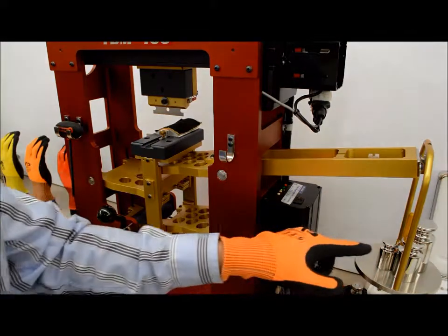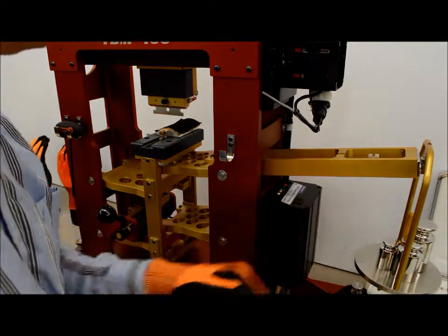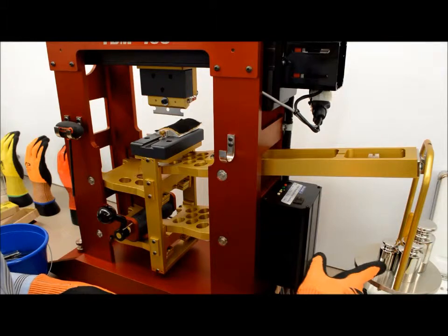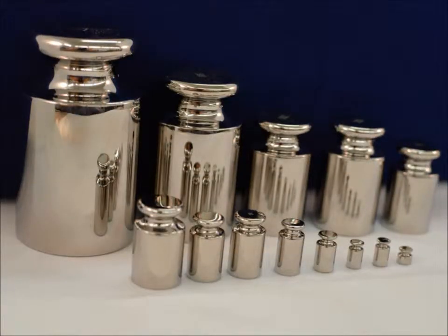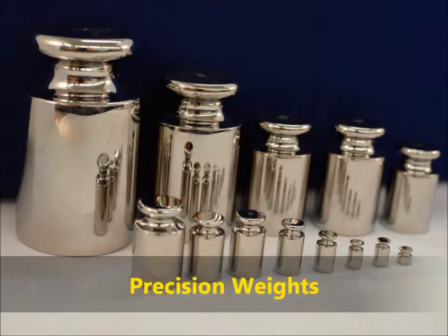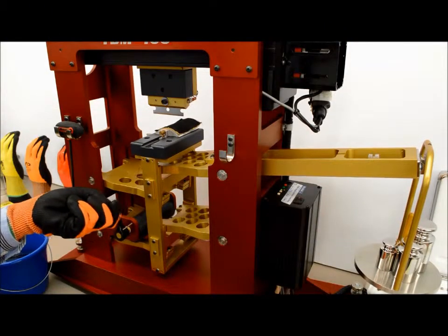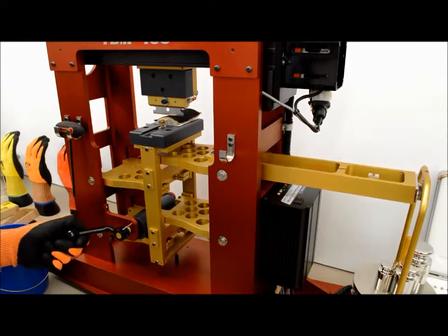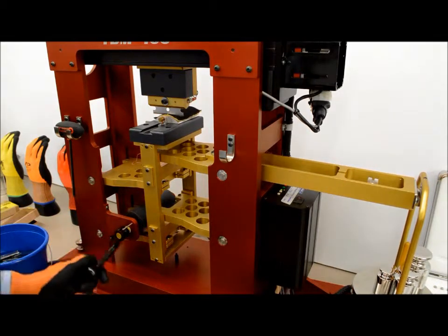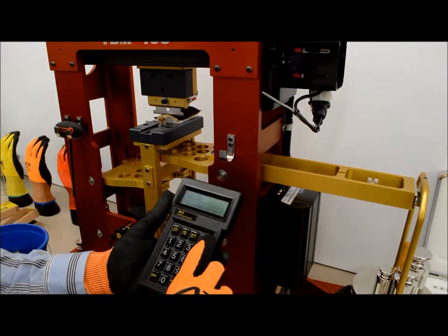Now, we check the weights over here. For this test, we've added 1,800 grams of weight from our precision weights. And now we bring the glove material in contact with the razor blade, and on the TDM100, we start the test.